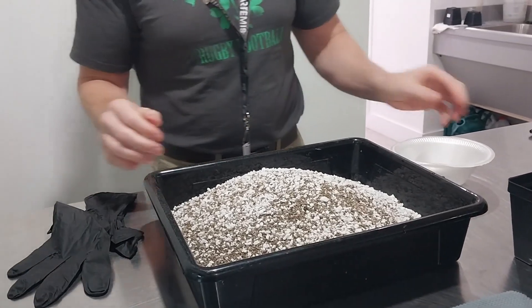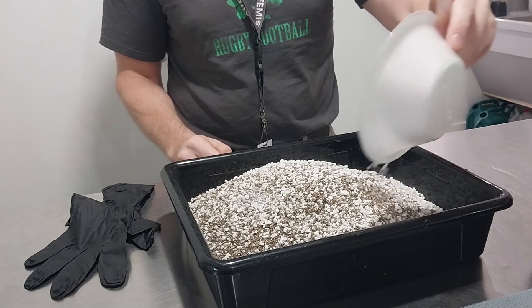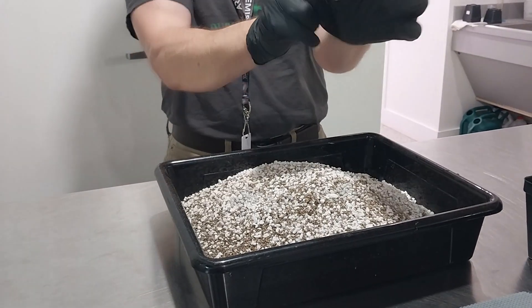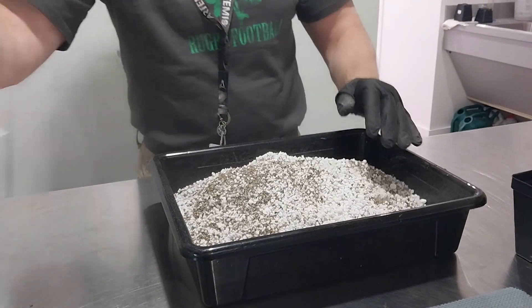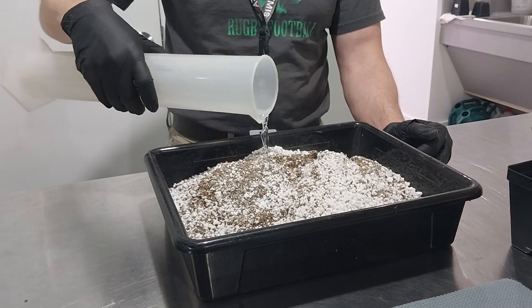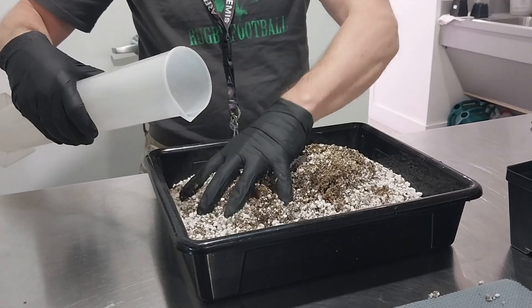Next, pour the measured fertilizer pellets into the perlite vermiculite media. Put on your gloves and begin mixing the fertilizer pellets and the media. As you are mixing, begin pouring in the water. Mix this media until the water is fully mixed in.